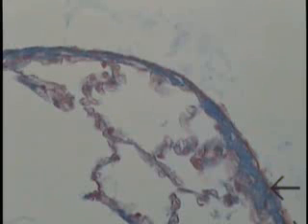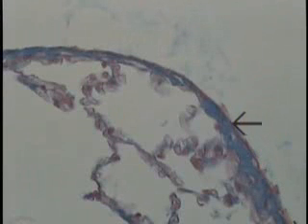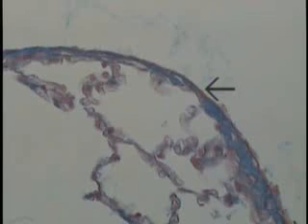So this is collagen stained blue, and then you can see overlying it and covering its external surface is a simple squamous lining epithelium. This is the mesothelium on the exterior surface of the lung. So this would be equivalent to the visceral pleura of the lung, that simple squamous lining epithelium of mesothelium and a bit of underlying connective tissue, which in this case is stained blue.